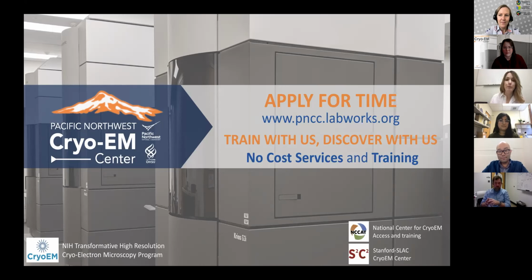For sample prep, we've got a Vitrobot and Leica GP2 plunge freezers and a Vitrojet that is right now still being put through its paces before its public debut. PNCC has been under COVID restrictions preventing on-site visitors, but we still offer one-on-one remote training and remote workshops on grid screening and data processing.